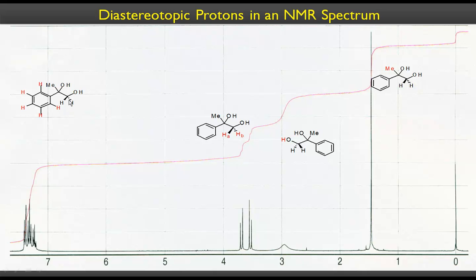Here is a case where you have 2 hydrogens which are attached to the same carbon, you would tend to think that they have the same chemical shift, so they should not be coupling with each other. But however, these hydrogens are diastereotopic because there is a chiral center here. If you were to have an absolute stereochemistry assigned to this, let's say if you had a beta methyl and alpha hydroxy, then you can assign some stereochemistry to that, and depending on that, this is either pro R or pro S. As a result, we have diastereotopic relation here between these two hydrogens.